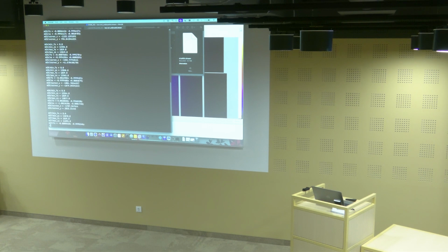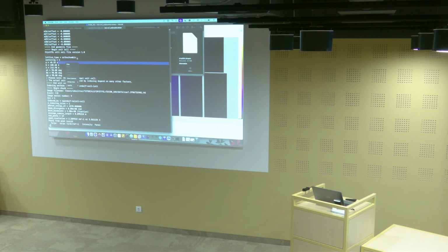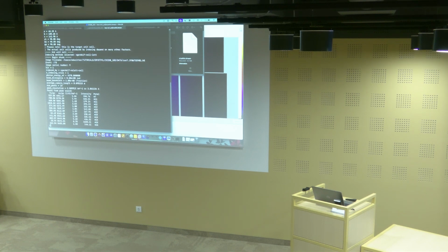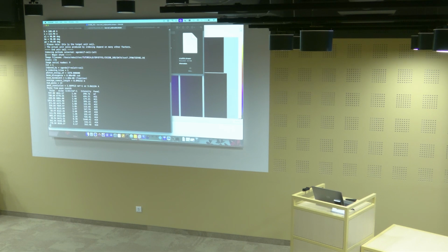So we go a bit down. This is a huge file. Good. Then if we gave crystfile unit cell information, that will be repeated over here. So again, we have exactly the same information like the lattice type, the centering, and the angles. Then it will again say which indexing methods we used. And then there will be repetition of blocks.